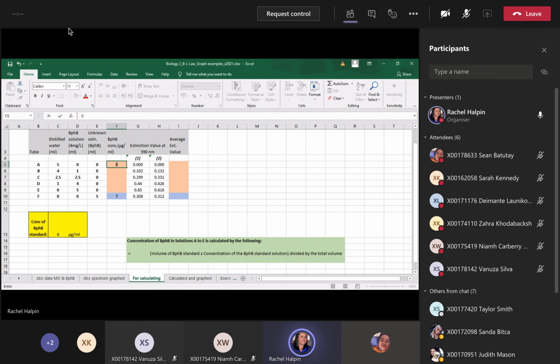So it's going to be 0. Now in milligrams, sorry, we were doing it in milligrams per litre. We have to convert that to micrograms per mil. Milligrams per litre is the same as micrograms per mil, I think. So 0.8, 2, 3.2, and 4. Okay. I think that's right, guys. Just check your conversion of units, okay? Milligrams per litre.